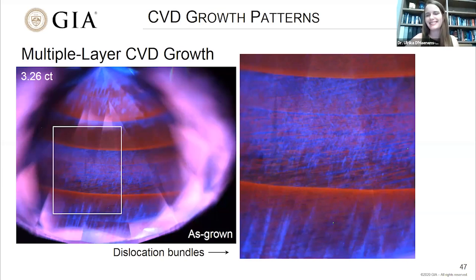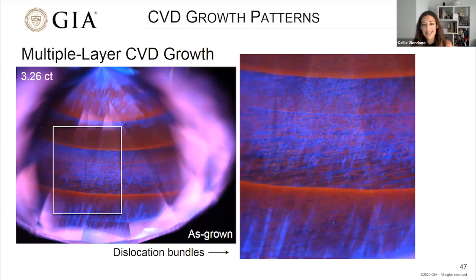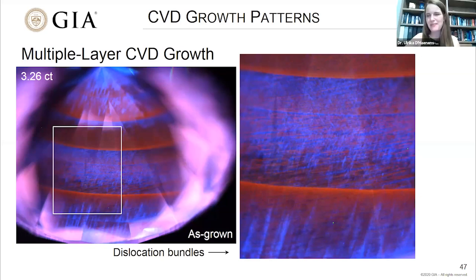Okay. Are the striations in CVD diamonds similar or different to curved striae in synthetic flame fusion ruby? I'm afraid I don't work with colored stones. We'll defer that. Sure. Yeah, sorry, I'm not sure. I'm afraid I can't answer that. But we're looking for very tightly spaced lines going through the material. Okay.